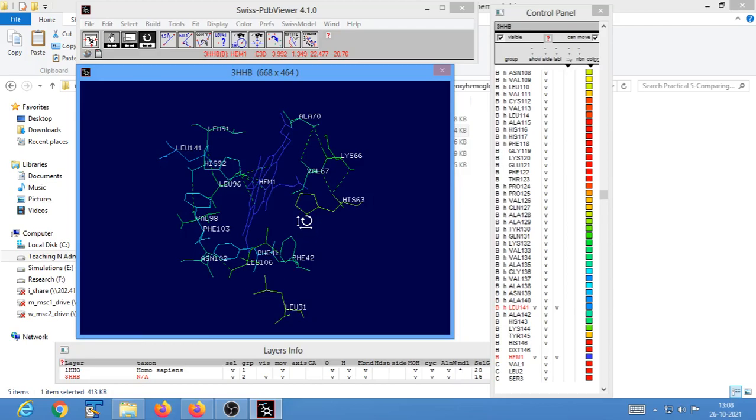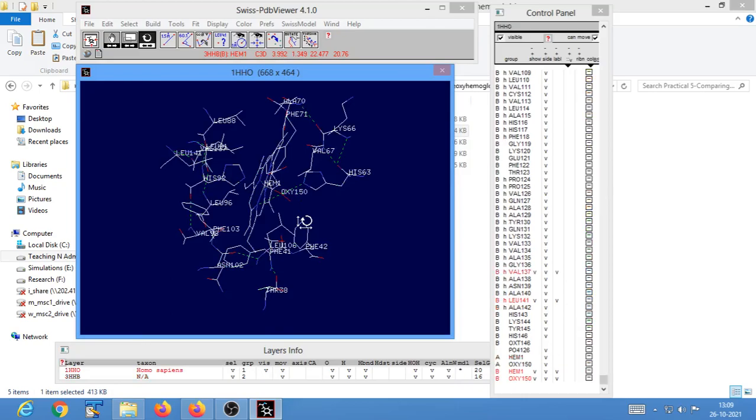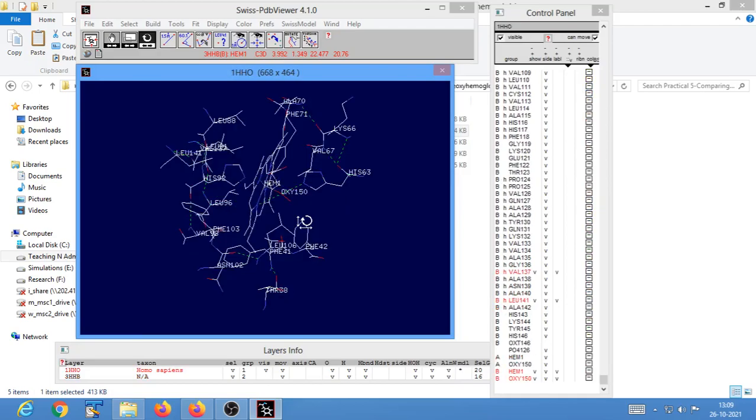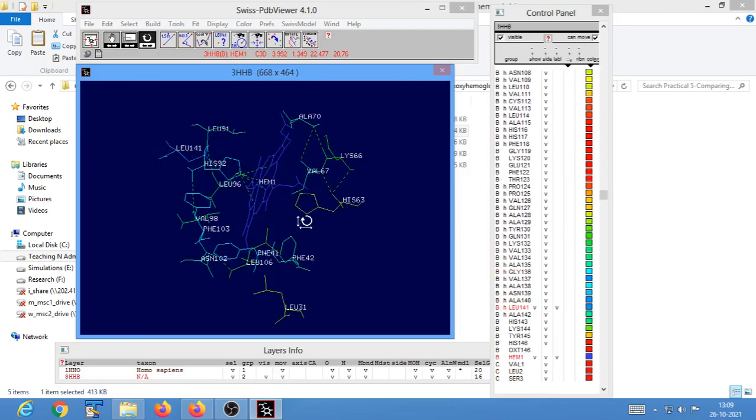In this way, every time you hold down control and press tab, that is what I call blinking. Each time you press tab, one layer becomes invisible and another layer becomes visible. So you can switch back and forth. We call it blinking between the views of oxyhemoglobin and deoxyhemoglobin. It's just like watching the hemoglobin breathe. Oxygen bound, oxygen unbound, oxygen bound, and oxygen unbound.